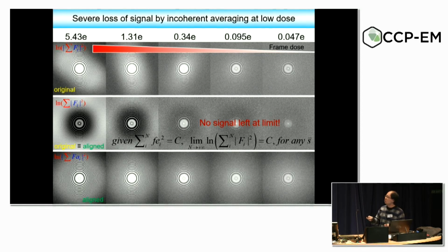Why? Let's think about one extreme case, where your detector is very, very fast and allows you to detect a single electron for each frame. In total, for a single frame, there is only one electron. And you do the Fourier transform. It's a constant function, is this correct?